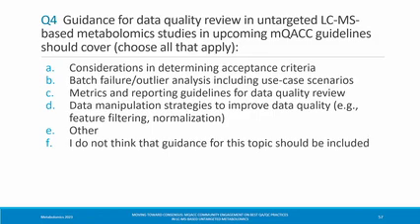All right. So in our group where we work with tuberculosis, MTB lysates, we've only relatively recently added pooled QC samples and moved toward shorter runs due to certain technical limitations in our space.